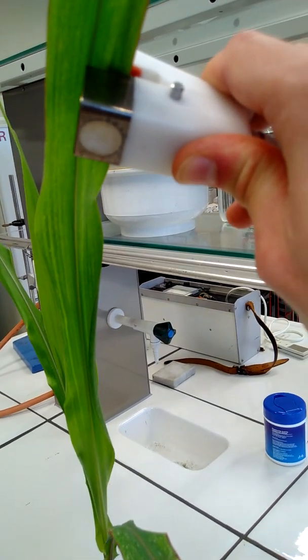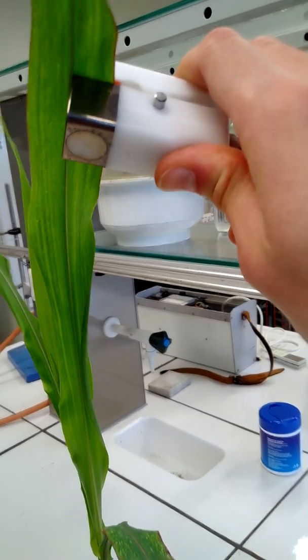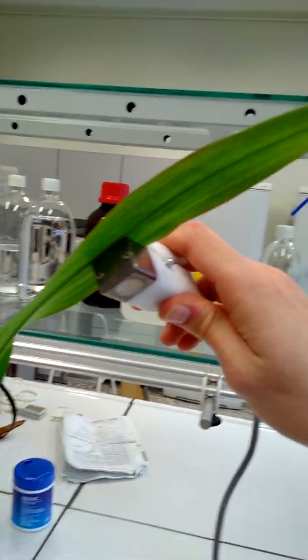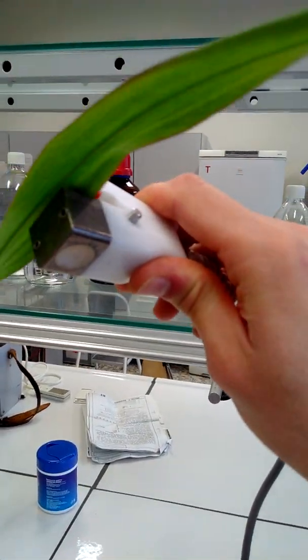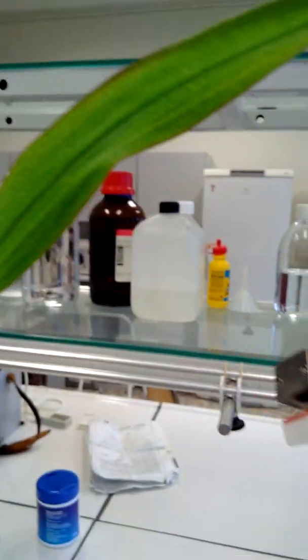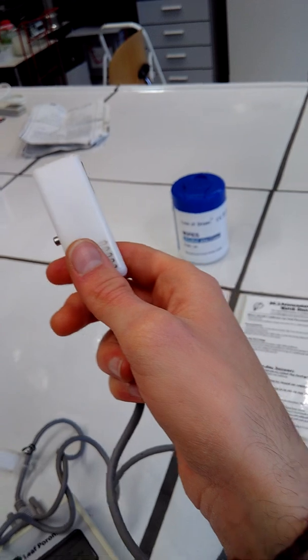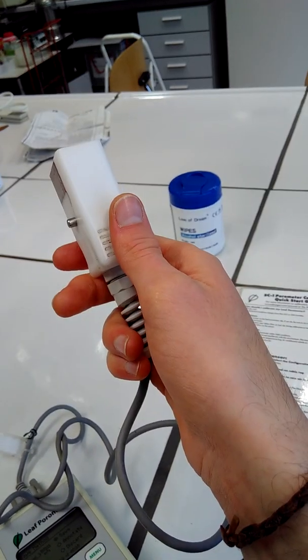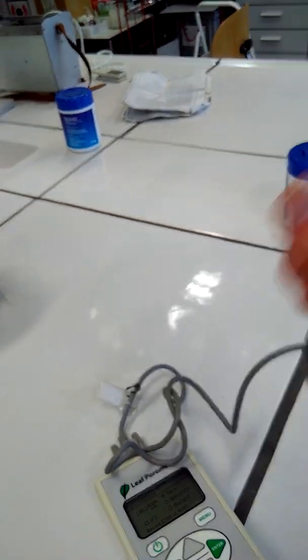You should always remember that the metal part is the part that is measuring. So in this case, we're measuring the lower side of the leaf. And the other way around, the upper side. So you want to know both sides. Depending on the plant species and where in the plant we are, you can have transpiration and stomatal conductance on both sides of a leaf.